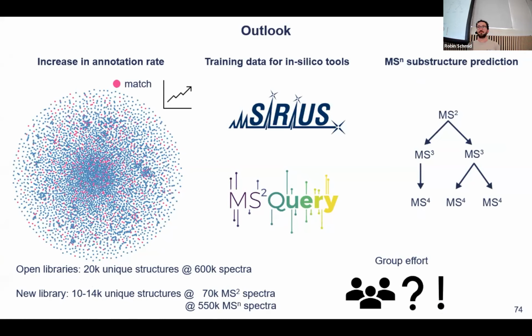I have a question, because when you generate this, the spectra are a summary of different energies, like consensus spectra or something. Consensus spectra, yeah. Did you ever test what kind of score it gives you at the end? Yeah, so the question was, if we merge spectra, what kind of scores that gives, I guess, against spectral library matching and maybe SIRIUS prediction and so on.